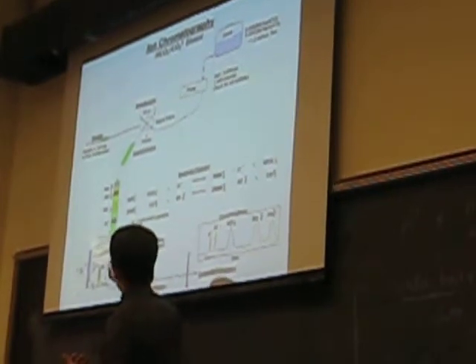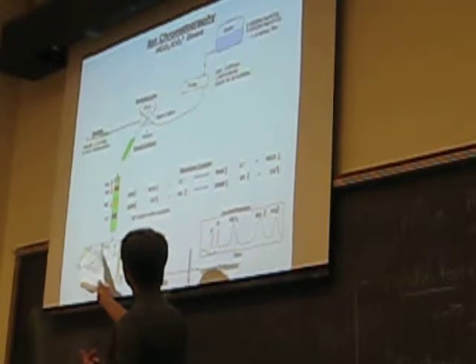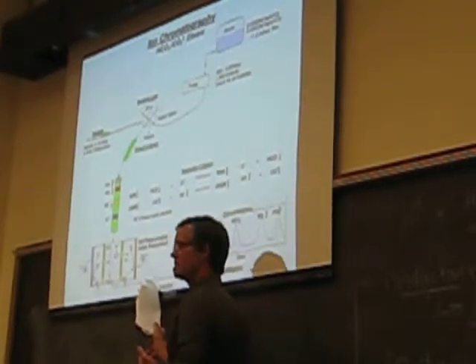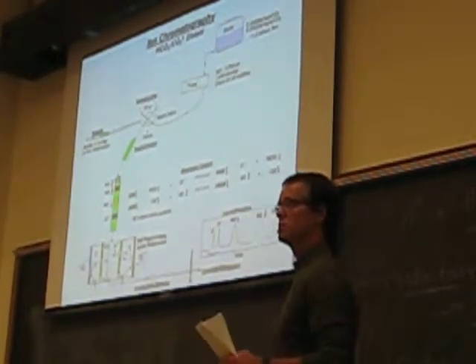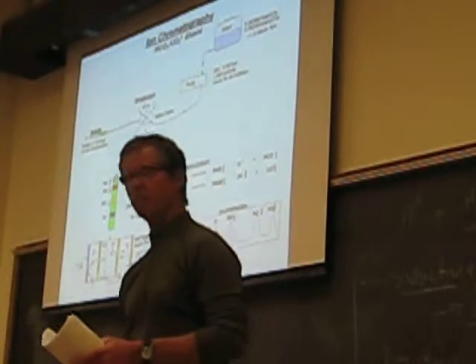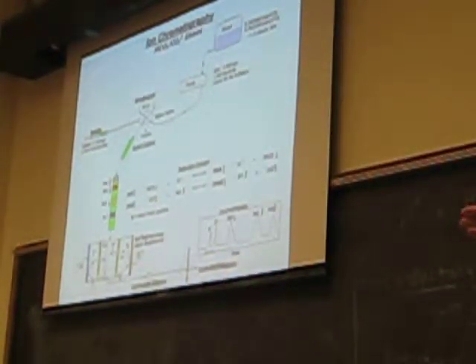And then it goes to the analytical column, and then it goes to the suppressor we talked about, where you remove the conducting influence of the bicarbonate and sodium ions, and then it hits the conductivity detector, and then you get your chromatogram. So you'd be able to put all these components together and understand what role each of those are playing, and which ones you will have control over in terms of selecting as an analyst.